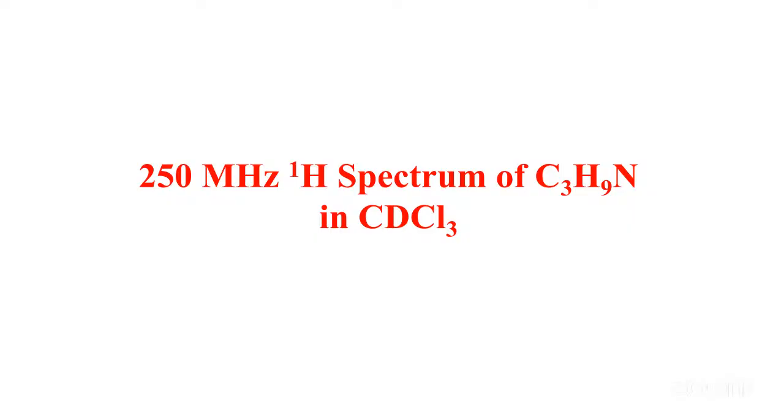One question I have here. Can you give us an example of isomeric compounds? So compounds having exactly the same formula. That's what I'm trying to show now. This is the example because, for the drug in the pharmacy college, they make drugs and they always worry about isomers, enantiomers, etc. That's why I am showing this example for them. Sometimes a single compound has two isomers and two diastereomers. Exactly, sir. You are right. I will show you that now.